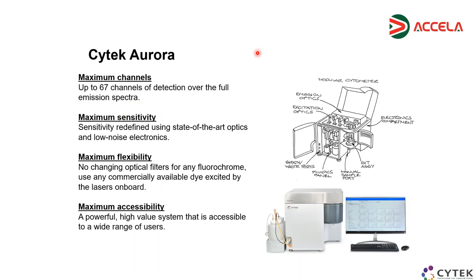Right. That's a very good question. So I guess Peter, right? Yes. Okay. Hello, Peter. So thank you for this question. It's quite a good practical aspect. The idea is that, if you want, we can even provide you the single FCS file for each of the dyes; we have tested like 120 dyes. Which potentially you can upload in your library and then reuse anytime for your correction.